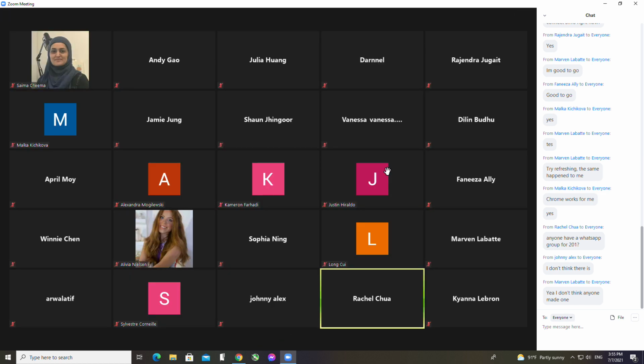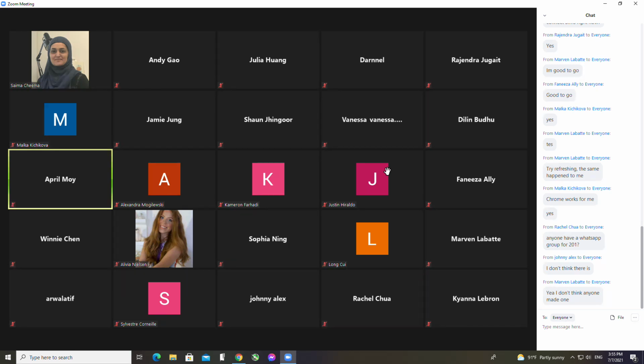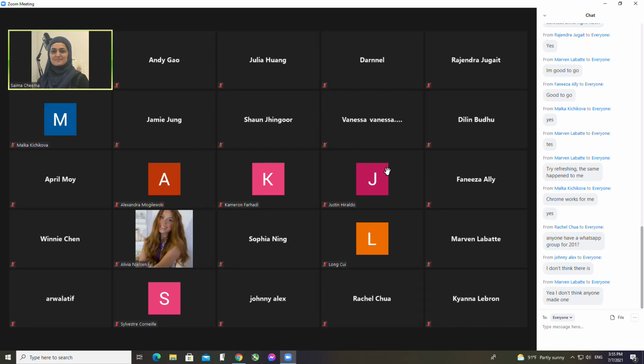Is the stage micrometer in red color? I think the stage is in black, isn't it? The ocular was red.